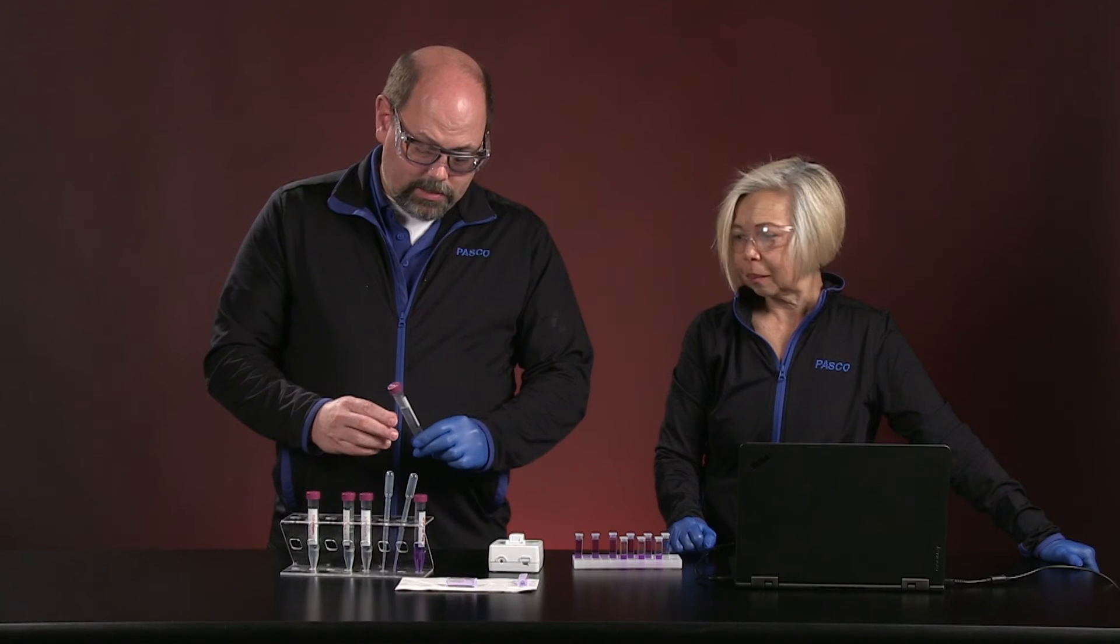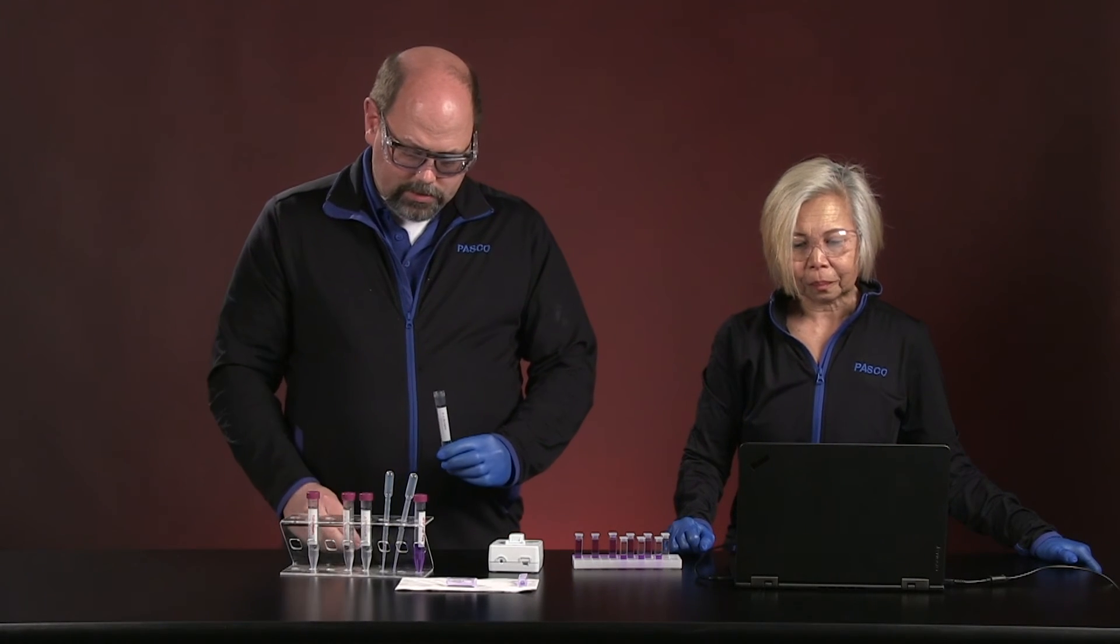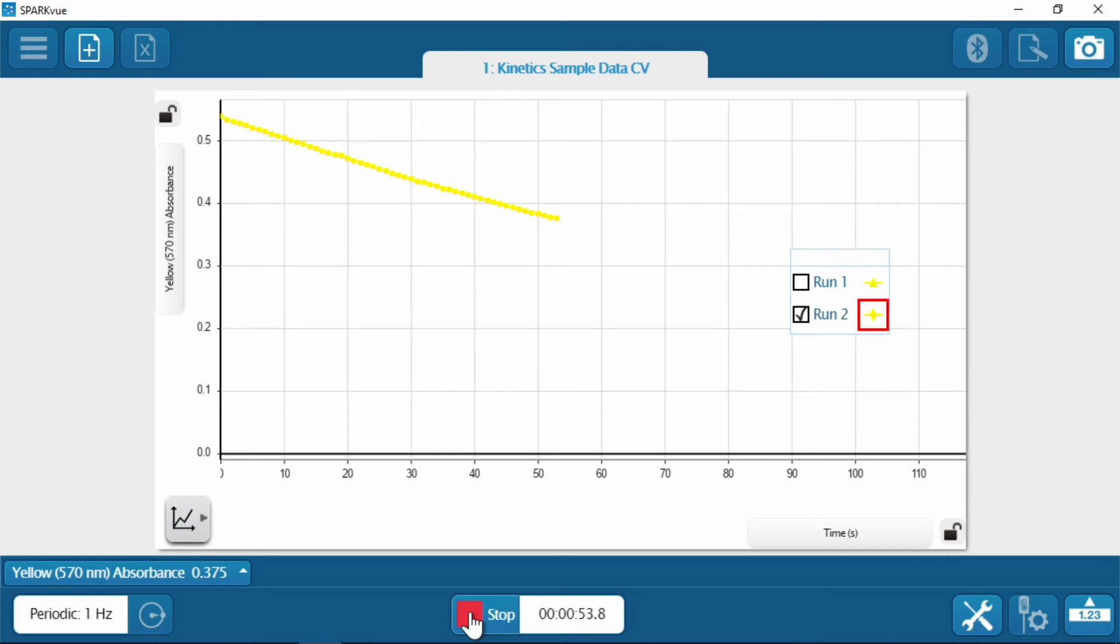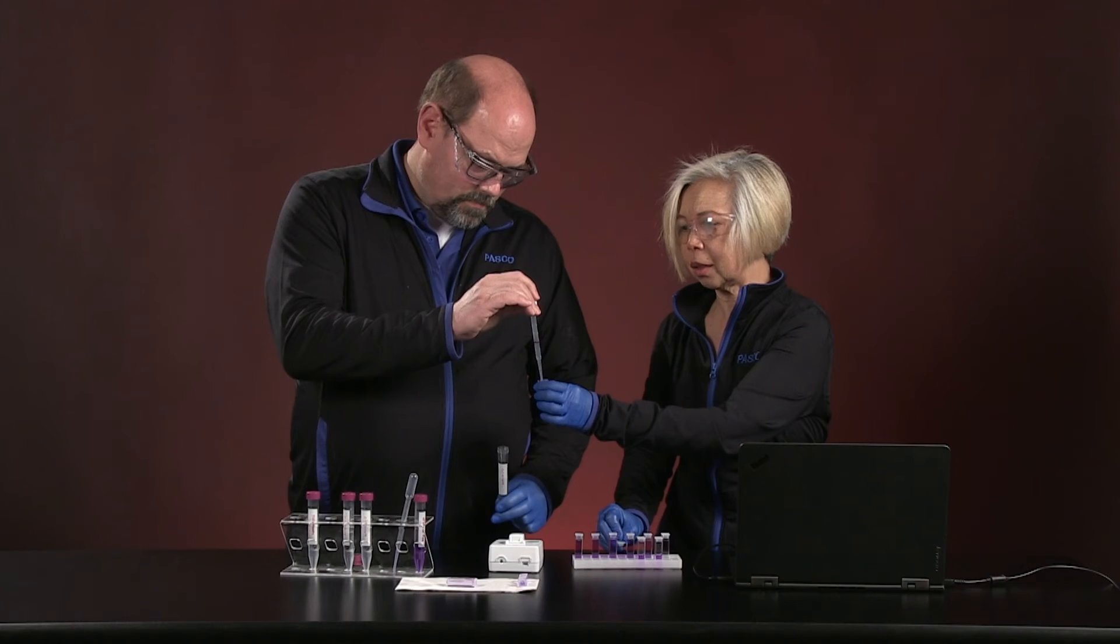While that's finishing up, I'll get the last more concentrated sodium hydroxide solution ready. We can follow this and see how that rate changes by putting in more concentrated sodium hydroxide. As you guys can tell, there is a noticeable rate change between the first run and the second run. There's that right there. Okay.